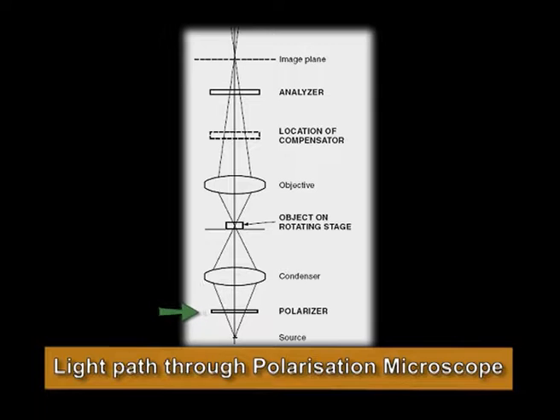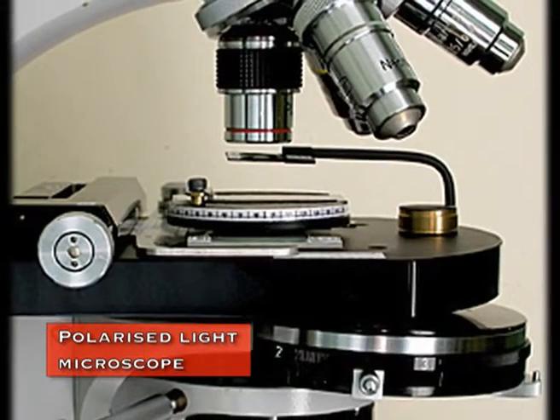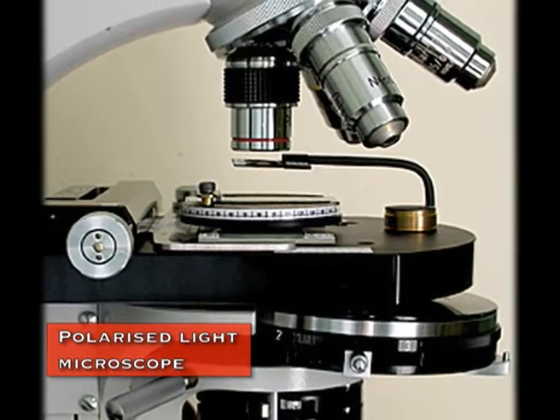This polarized light now passes through the condenser, is focused onto the specimen, passes through the specimen, and then whatever is coming out from the specimen is collected by the objective, and on the back focal plane of the objective there's an analyzer. The importance of these polarized objectives is that they're not the same as the objectives which are used in other bright field microscopes.